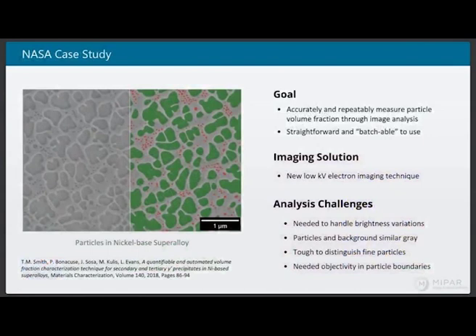I did my PhD in material science at Ohio State University, and I can tell you firsthand how many challenges there are in the material science community around image analysis, both in many different aerospace alloys. I did my thesis on titanium microstructure characterization, and that really led to the development of MIPAR in the first place.